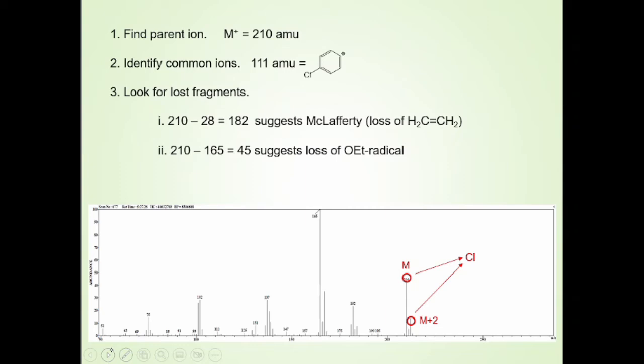But if you simply use the molecular weight on the periodic table to calculate the mass of something containing bromine, it would never match your masses on the chromatogram because you're using a mass of 80, but they're really 79 and 81. You'd have peaks one above and one below what you're calculating. It's important to remember that we're actually dealing with single molecules, and we have one isotope or the other.